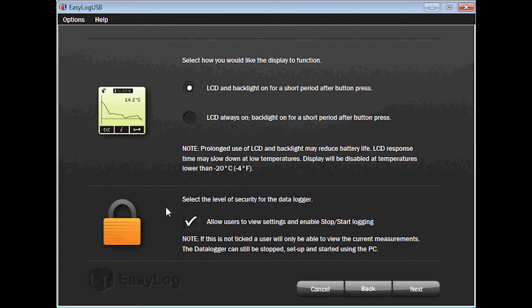Next, you will need to decide the security of the device. If you uncheck the box, any user can view the current measurements, but they cannot do anything such as stop and start the logging. You will need a PC to stop the logger and view the data history. I will leave the box checked, but only because this is a demonstration. Click Next to continue.